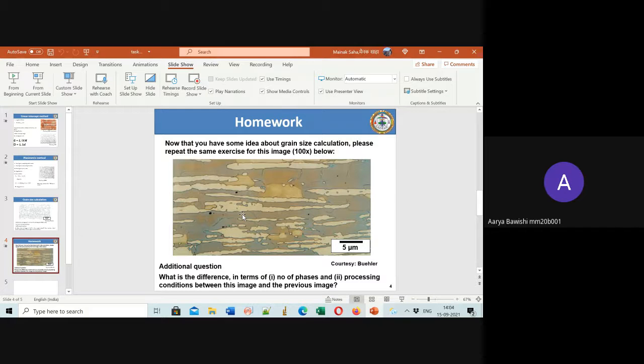So aren't there three phases? I mean, the color gradation. Looking at this, it might be hard to consider that there are three phases. My practical experience is that it is either three phases, or two phases is still possible, because one of the grains may have been over-etched too much. I don't think this is because of another phase. But to be on the safe side, you can write that there are at least two phases. Okay.